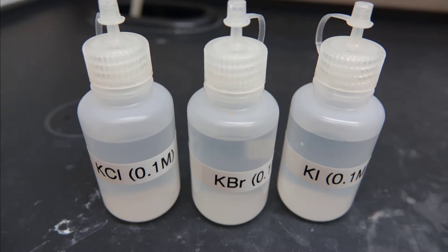The clear bottles labeled KCl, KBr, and KI are potassium chloride, potassium bromide, and potassium iodide. These are the ionic forms of the halogens.